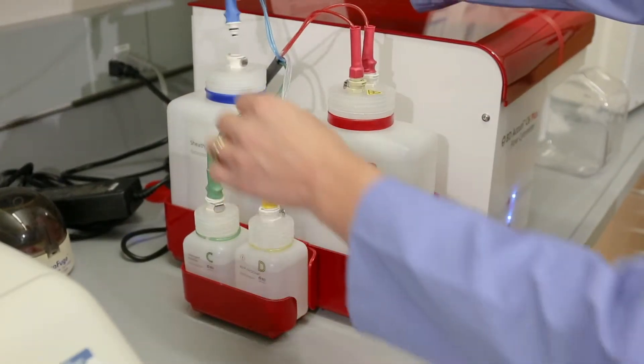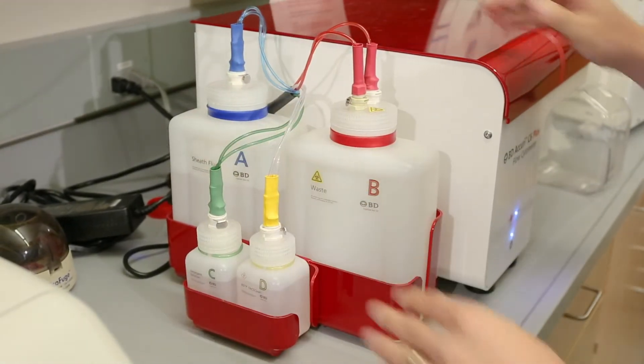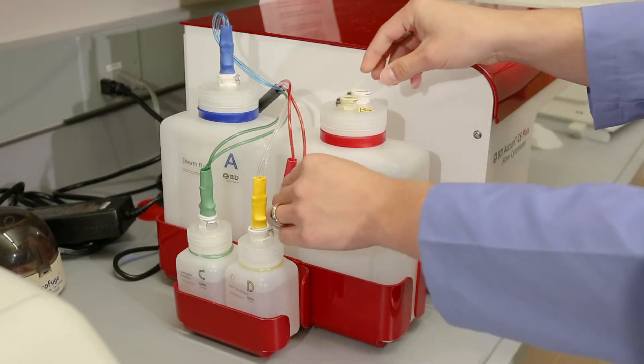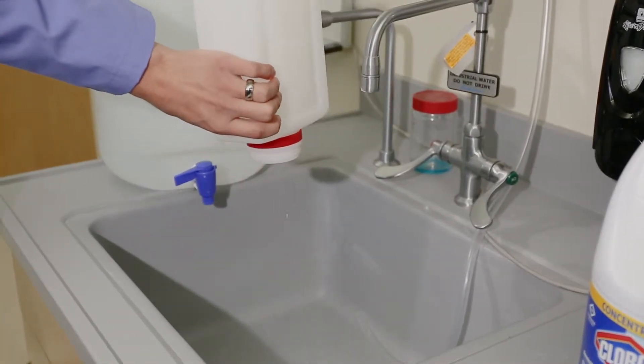Clip all attachments back onto the tanks. The clips are color-coded to match the appropriate tank. Empty the waste tank in the sink and add bleach to the bottom of the tank.